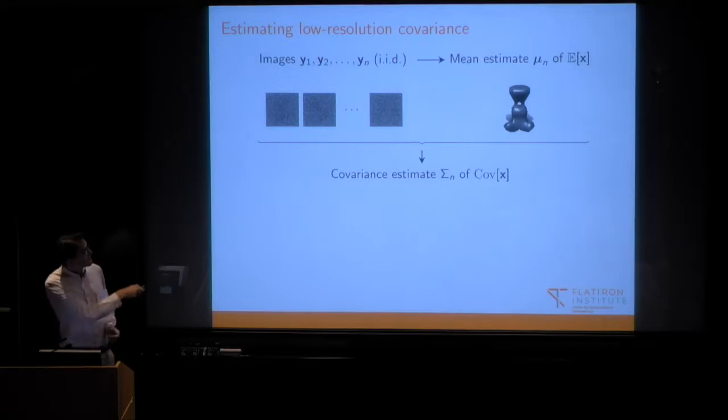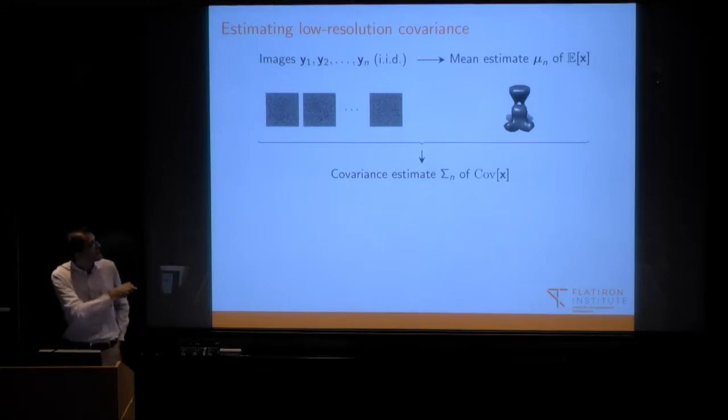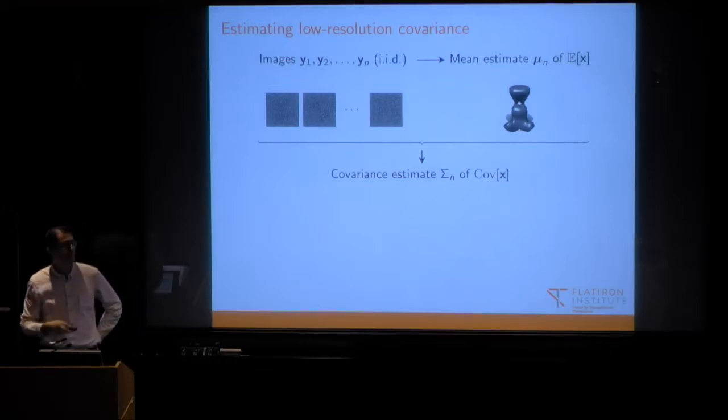So if we are to do this covariance estimate, we need to work at low resolution. But it turns out you can still get a lot of important information this way. I'm not going to go into detail about how we do all this estimation, but essentially they're least squares estimators that we apply to these images. And again, we assume that we know the rotations and so on, so we can formulate it as linear least squares and optimize it that way.